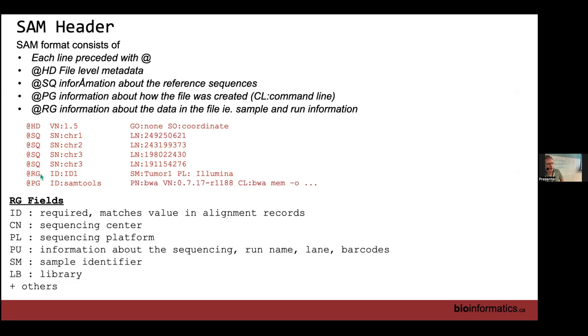One important feature of it is identifying read groups. The information that's in a BAM file may come from multiple sequencing runs. They often combine it together, but we really want to know where it came from. This is a very important field that's included to show the provenance of where that data came from that's now in that BAM file. It is used downstream by a lot of programs, especially duplicate marking and variant calling as well. They have identifiers in here indicating what that data is associated with.